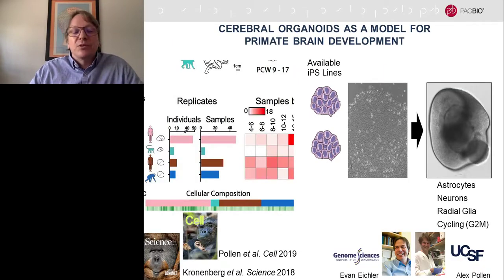But of course, we didn't want to do something with those cell lines. We wanted to do something a little more interesting. So I actually took advantage of a long-time collaboration I've had going on with Evan Eichler's group and Alex Pollen at UCSF. And that's to study the great apes and what differences they harbor that make humans different from the great apes. Because it's difficult to work with real ape samples, they've been using cerebral organoid models.